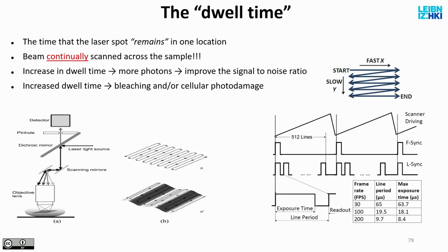The microscope will give you a suggestion. For example, divide the image into 512 by 512 pixels. Or it will tell you the optimal pixel size based on the Nyquist criterion that we talked about much earlier, which is 145 nanometers. You click on the button or type in 145 and it's set, because it will set the integration time accordingly. So I have full freedom.